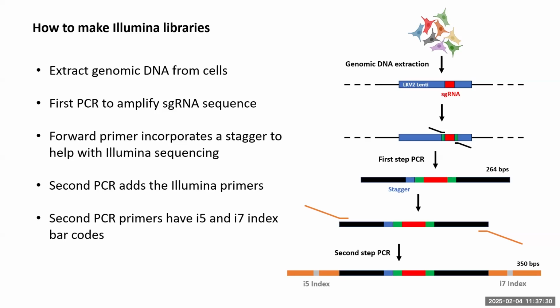And you don't want to run all those samples individually on sequencing because you're going to have 400 million reads on them. And it's going to be really expensive. What you can do is you have a set of these I5 and I7 primers with different barcodes. You can mix and match them. And so in the end, you can do about 20 different combinations of these primers. So you can essentially produce 20 different libraries that you can then pool together and sequence in one go on the Illumina run. And then you're just calculating how many sequences you actually need to generate the coverage again.